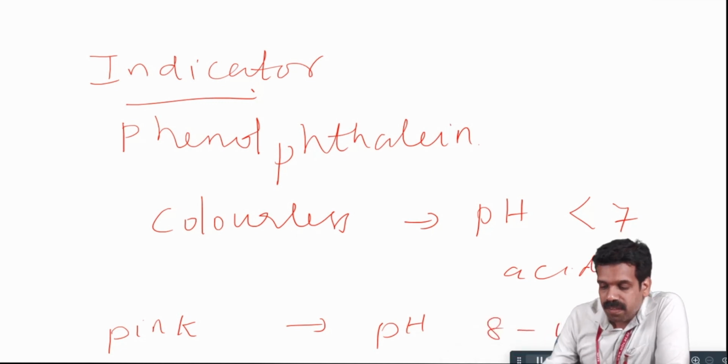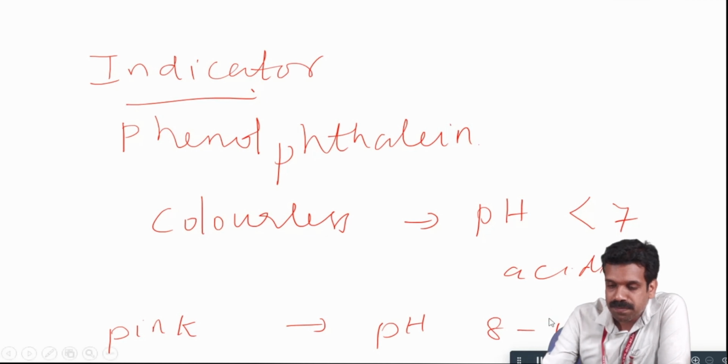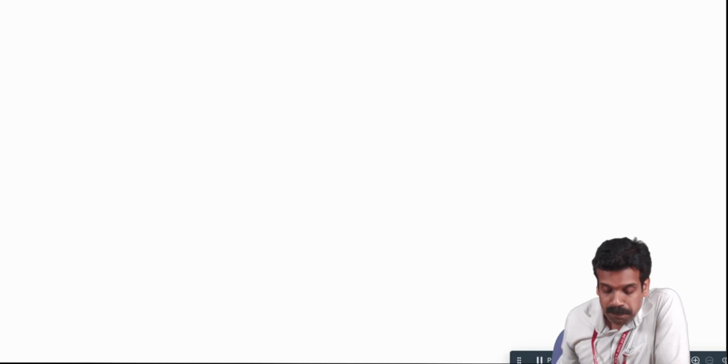So when we want to do a titration, we need an indicator also. In some other cases, for example a complexometric titration, you need to add buffer solutions also, but I am not going to discuss that here. I will stick to the acid-base titration only. For this acid-base titration, we just need the indicator as the extra chemical, nothing else.